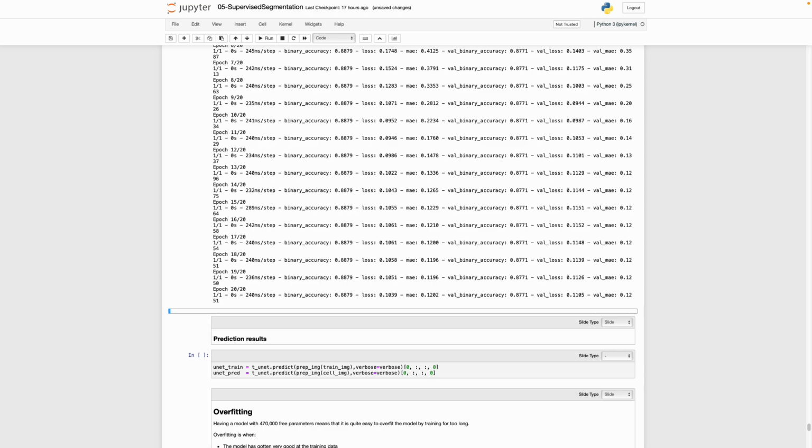There's only 20 changes to the parameters throughout the... No, it tries to optimize everything. So you have 1,000 parameters, but it's not like 20 different versions of those 1,000 parameters being changed. Each epoch is trying to do the best optimization given what it already has, so given the weights it has and what the optimizer can give back.